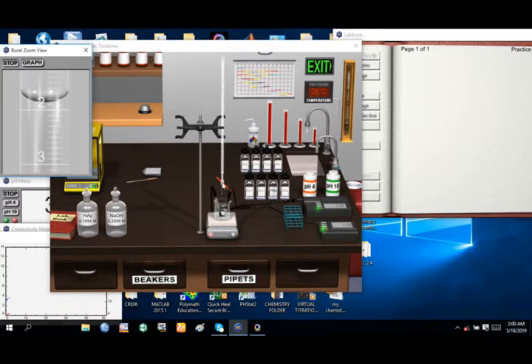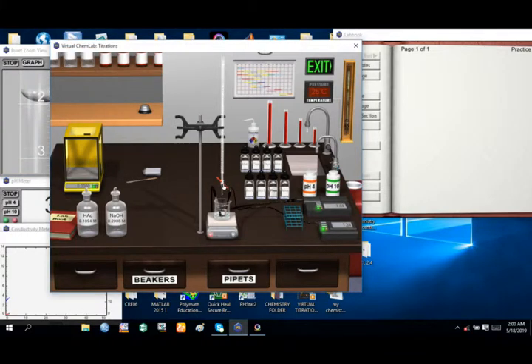While the experiment is running, it's gradually running. You can put it in a slanting position to make it run a bit faster. When we are about coming very close to a certain point of the volume, we can start running it drop by drop.